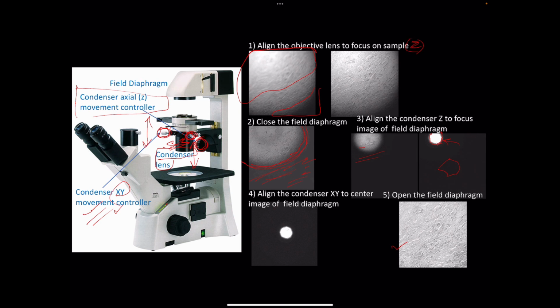It cannot be done for a simple reason. The answer is that the illumination optics must be aligned relative to the image formation optics. Since we are using different kinds of objectives in a particular system, sometimes you're going to use a 5x objective, sometimes a 20x objective, other times a 40x objective, and for live cell imaging of nanoscale structures, you're going to use the 63x or a 100x oil immersion objective.